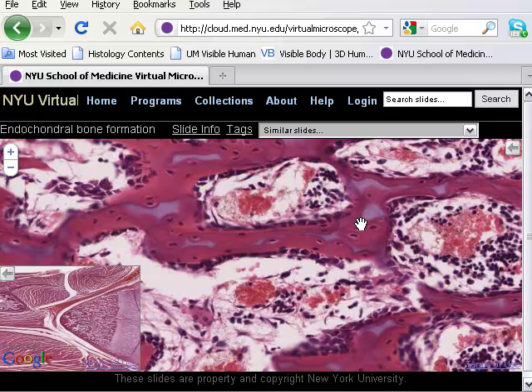For now, the first way that I'm going to speak about assumes that you have installed Z-Screen on your computer. It's available from the URL I've previously given to you. You have actually started Z-Screen in advance of surfing the virtual microscope. So I have Z-Screen started on my computer, and the command to activate Z-Screen to copy or capture a screen image is Control and the print screen button on your keyboard.